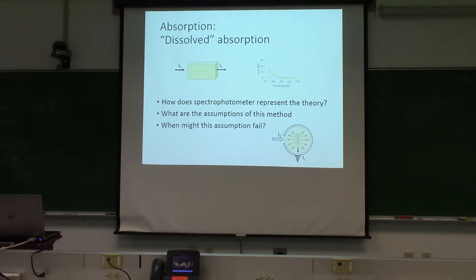And so we're calling it absorbance because we are saying that we're excluding scattering. But really what it's measuring is optical density. There could be scattering in there, could be absorption in there. So spectrophotometers provide optical density. If there's no scattering, you can call it absorbance. So I hopefully made all the changes in all of the lab handouts to absorbance. But if I didn't and I have optical density in there, just know that the optical density is what you're measuring; it is absorbance if you're assuming that there's no scattering.